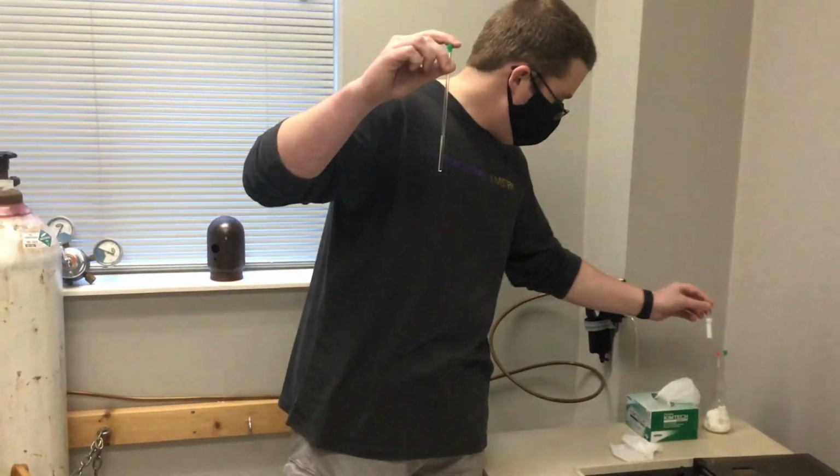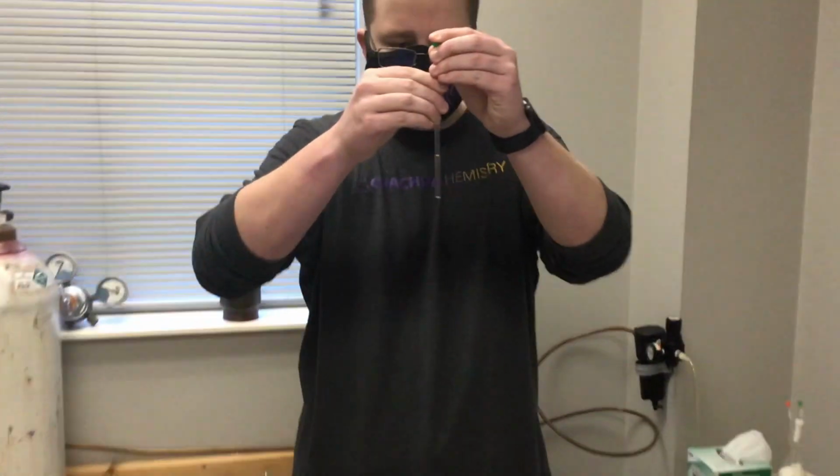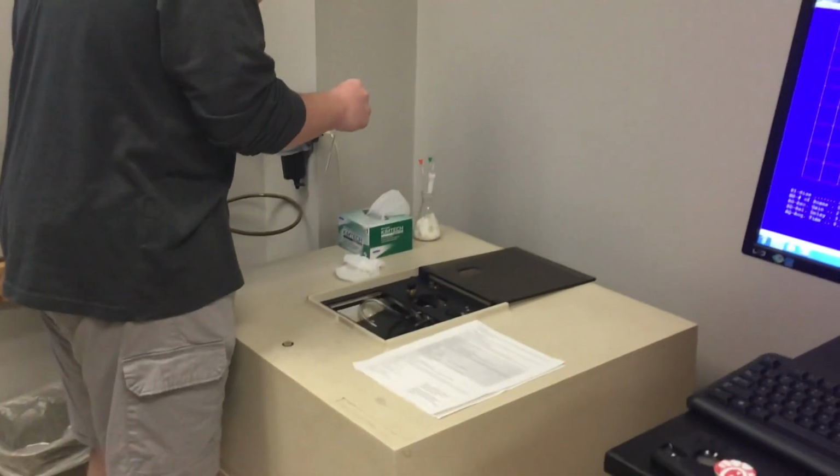You'll only need about, let's see if I can set that there without it touching anything. Good. You only need about two fingers' worth of sample inside. So this actually may be a little much, but this is about all you need. You don't need any more than this. That right there will have enough in the tube to get you a strong reading out of the NMR.